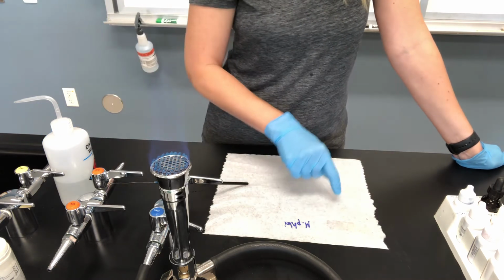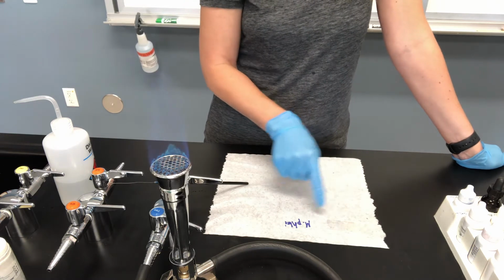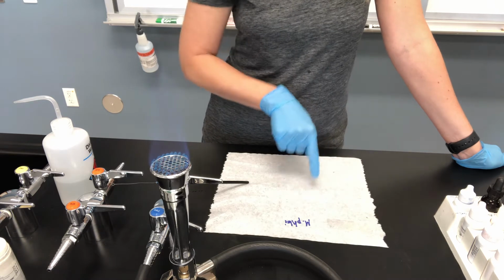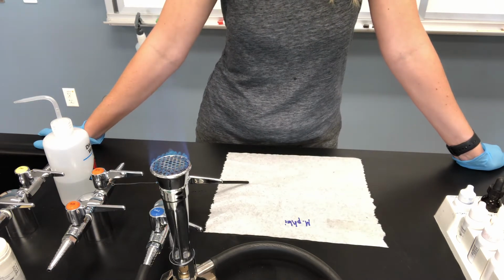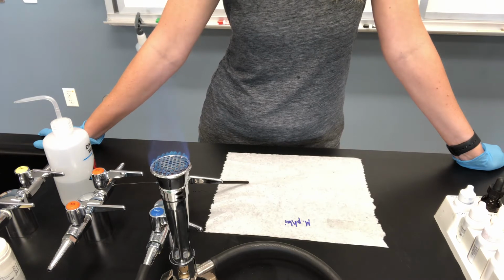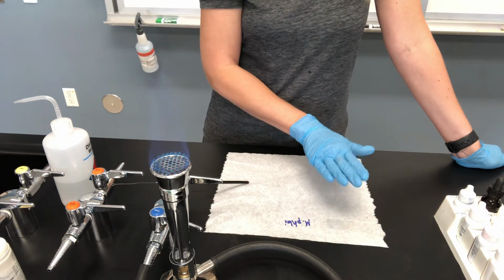Because you're going to be doing 3, it's best to do 1 at a time on this first day, because you don't want to be doing all of these different timings for 3 slides at once. Whenever you have multiple slides running at the same time, you can do the smear and heat fix and get those all ready at the same time.